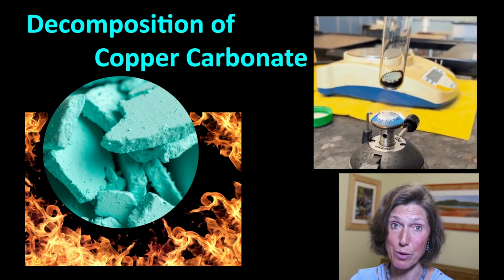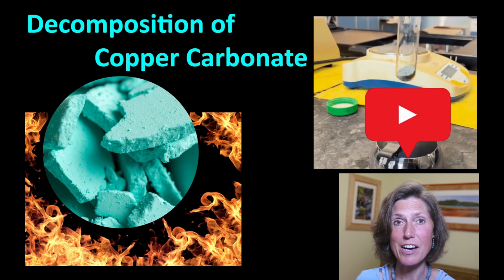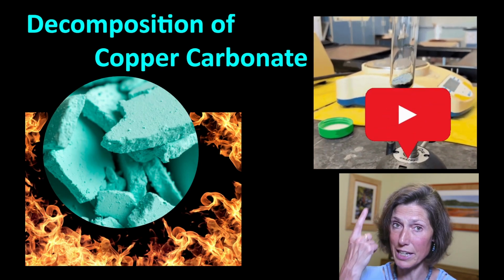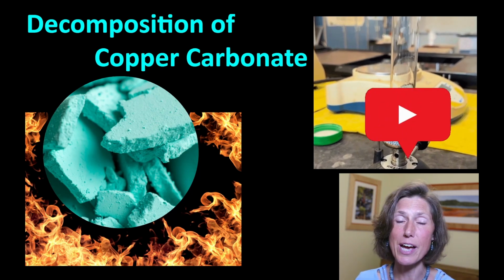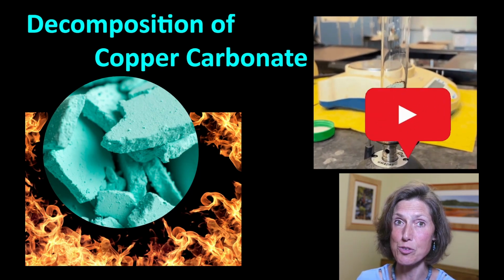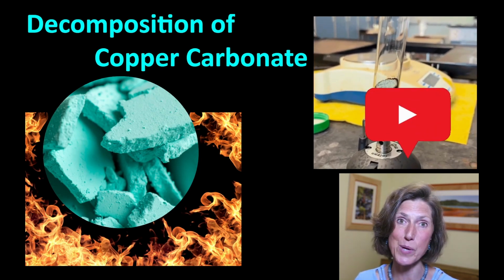into a black powder. This is actually the 3rd chemical reaction that I'm sharing in the video linked above. The 3rd out of a total of 7 key chemical reactions that I've done with my students in my classroom. Check out the video if you want to see the remaining 6 chemical reactions.